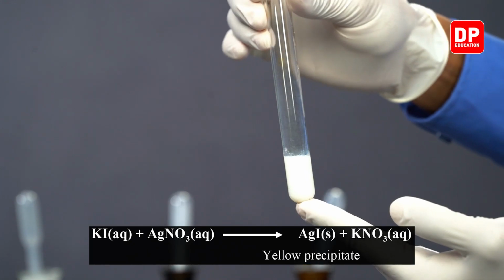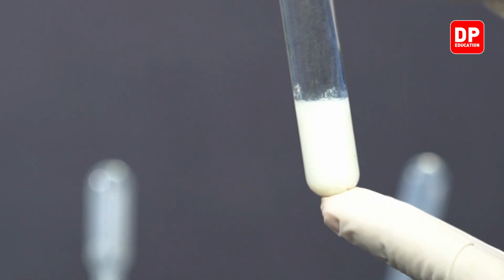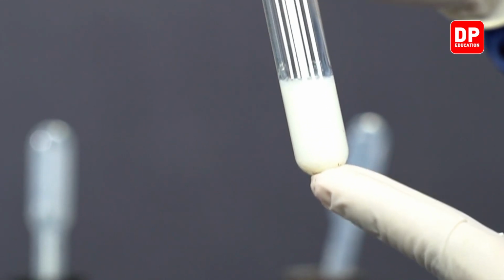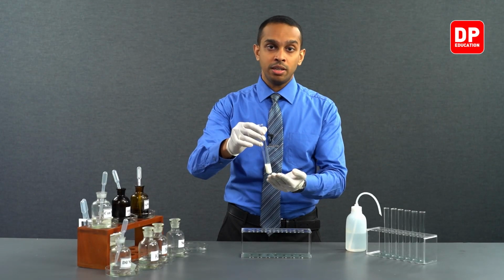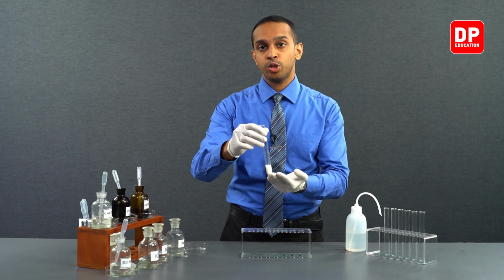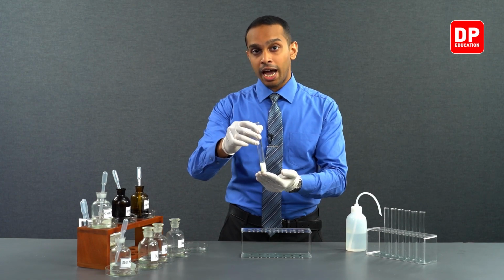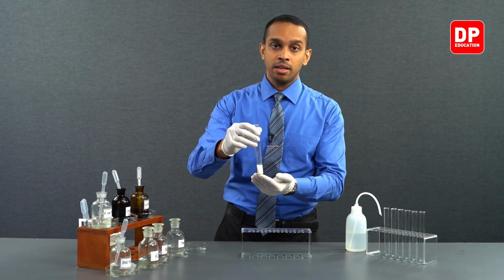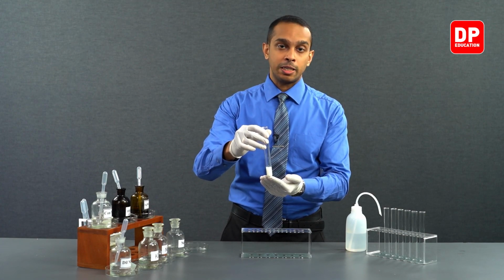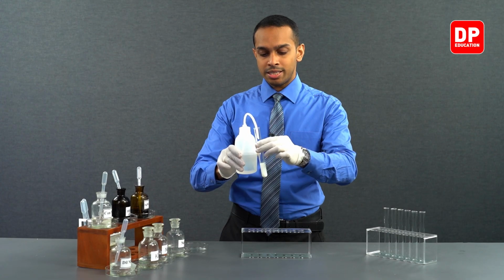Now this yellow color is quite low in intensity. You will not be directly identifying it as yellow if you do not compare it with a white background. So at the end of this practical, I will compare all of the three colors of silver chloride, silver bromide and silver iodide separately, and I will show you how they compare against each other. But we have to know that silver iodide has a yellow, or sometimes it is described as a bright yellow precipitate.